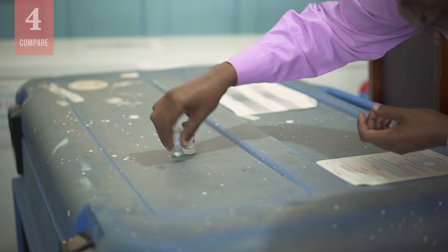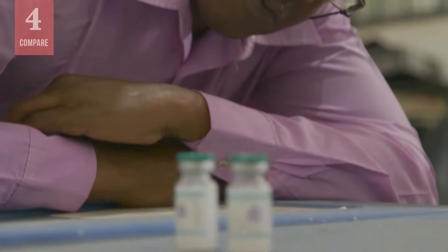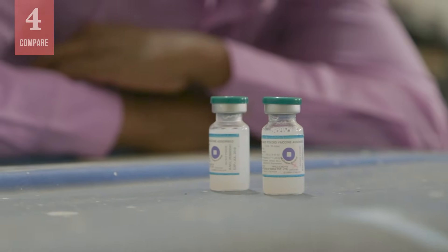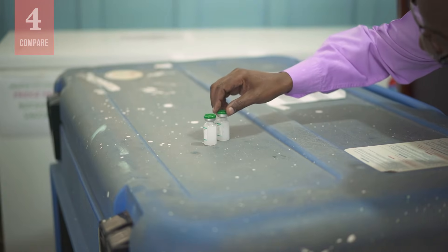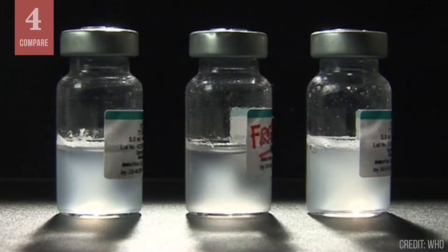Shake both vials vigorously for 10 to 15 seconds. Now place both vials on a flat surface side by side and closely observe the contents against the light. Watch and compare the rate at which the sediments settle in the two vials. This shows two possible outcomes of the shake test.